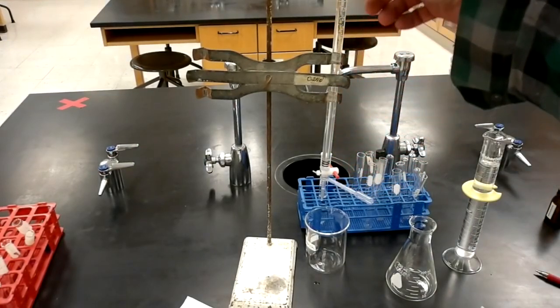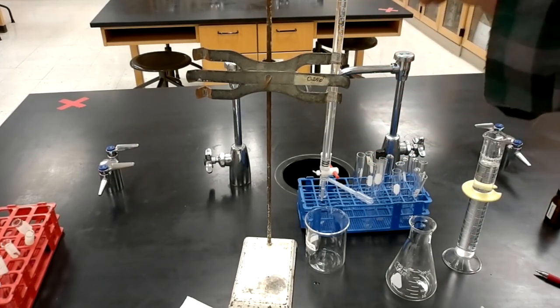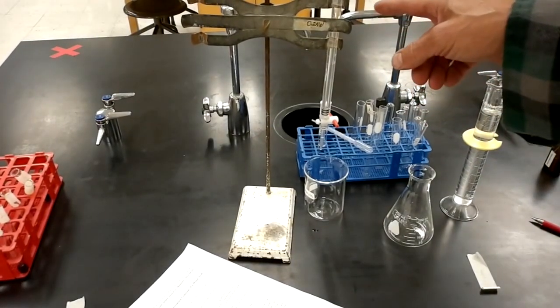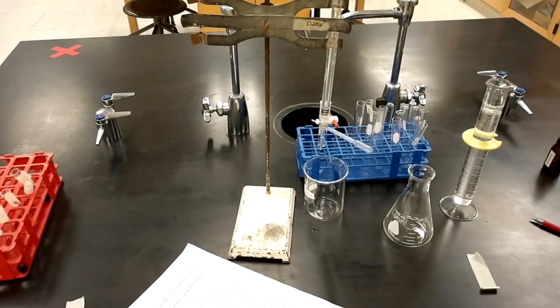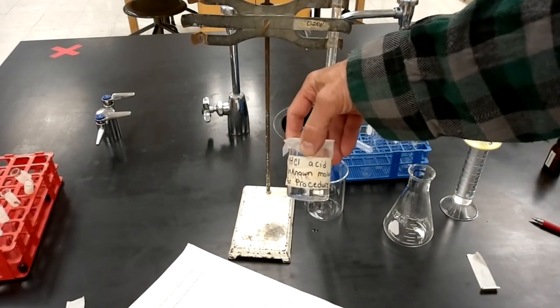This thing is filled with 0.2 molar sodium hydroxide. So I know what's in here, I know its concentration. Now in titration, what's going to happen is I'm going to add this base to some unknown acid. I'm going to mix up a concentration of this unknown hydrochloric acid.